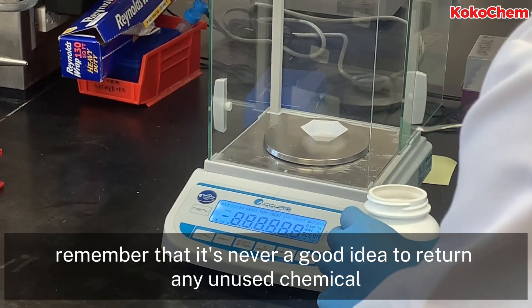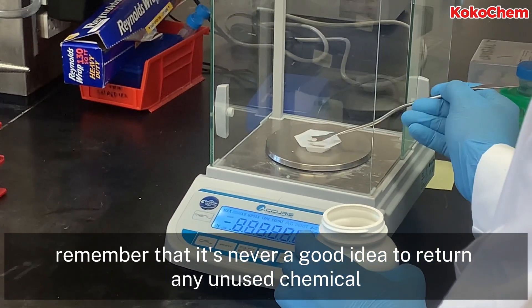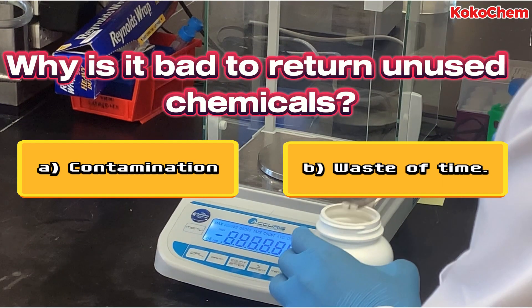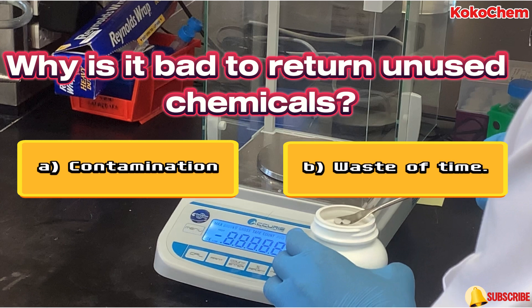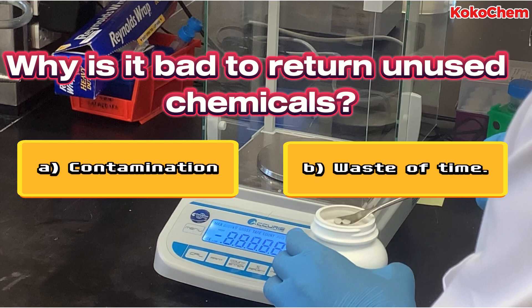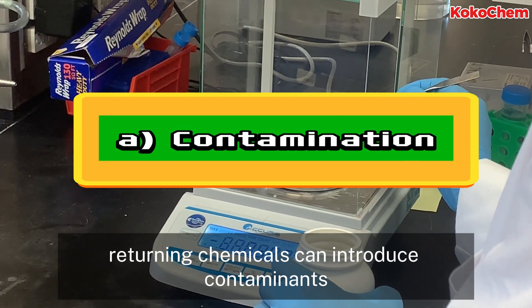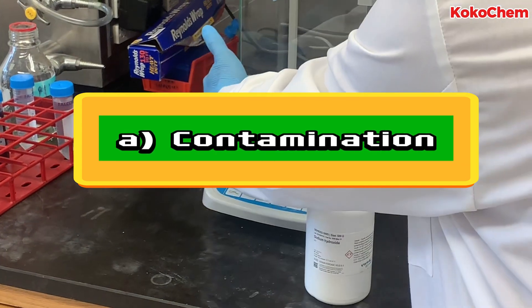Once you've measured the correct amount, remember that it's never a good idea to return any unused chemical into the original container. Why is it a bad idea to return unused chemicals to the bottle? Exactly — returning chemicals can introduce contaminants. Always dispose of unused chemicals properly.